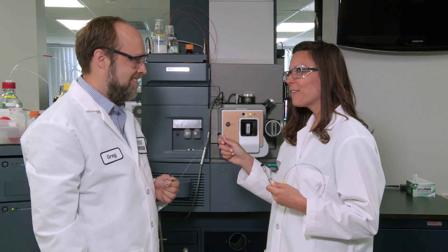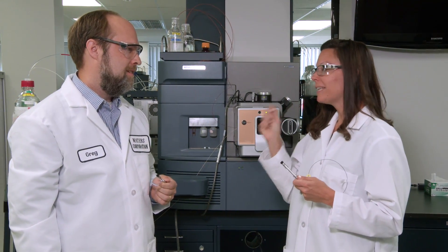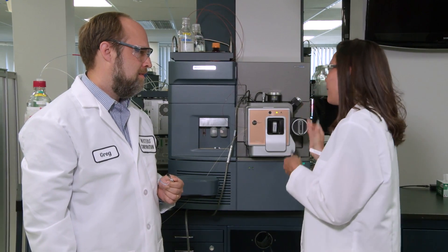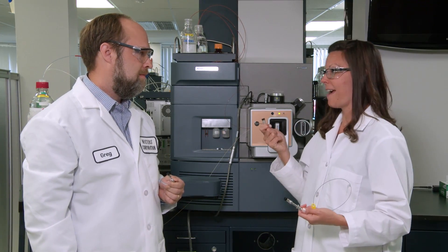I was looking for you and I was looking for this system because I have an issue. I have a really complex sample that I'm running analytical scale chromatography on, but I'm just not getting the sensitivity. So I was hoping to use microflow. However, I have to inject large volumes and I heard that this system can't handle that.